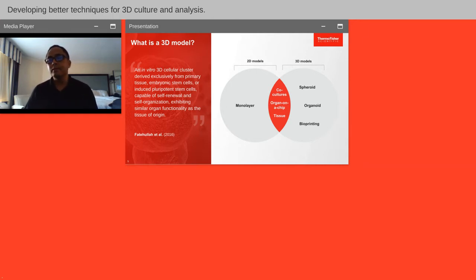Another method that's used is the organ-on-a-chip modalities, which utilize a microfluidic device where you have cells placed in these microfluidic channels, and you see the effects that flow and perfusion of media and drug have on the system, something you'd see in the in vivo setting. The monolayer culture I mentioned earlier is usually used with immortalized cell lines, but to add complexity, you can also use primary cells, or cells that are procured freshly from tissues, again, to get that more in vivo-like environment.